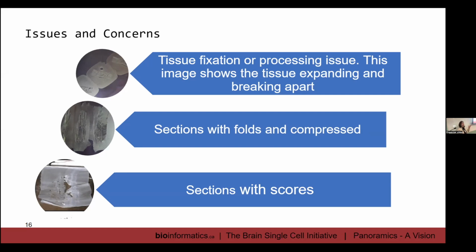Next to that would be your tissue processor. Those two steps together, if they're not done properly, you're not going to get a good section and you're not going to get very good RIN scores either for your DV200. And you're not going to get a Visium HD for sure. It's going to look like garbage, exactly what it is. Garbage in, garbage out.